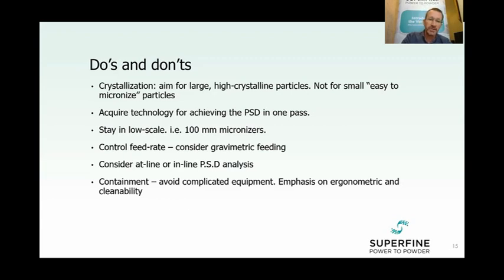And then you would consider either at-line or in-line PSD analysis. A bit about both. In-line means that you have a laser diffraction apparatus sitting inside your micronizer or inside the external tube, and it watches the particle size online all the time, and maybe it even corrects the feed rate during the process in real time. It's very complicated, it's expensive, it is difficult to install.